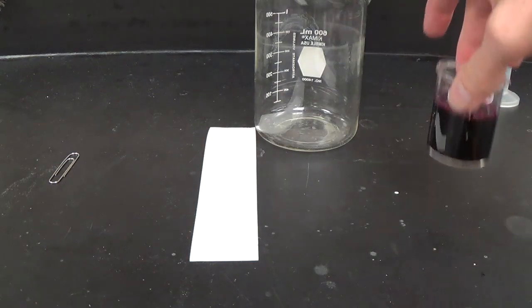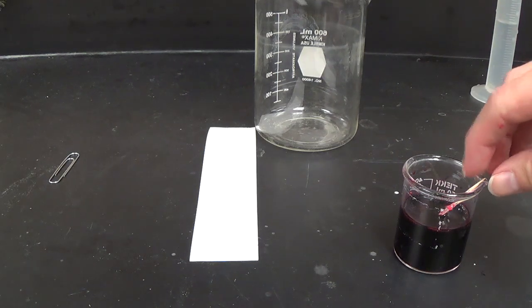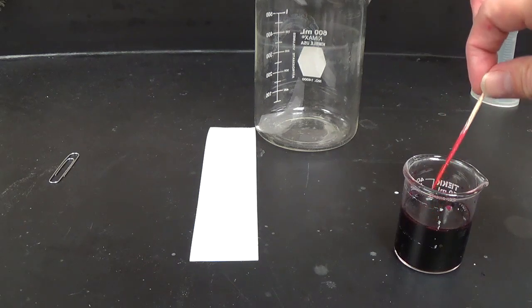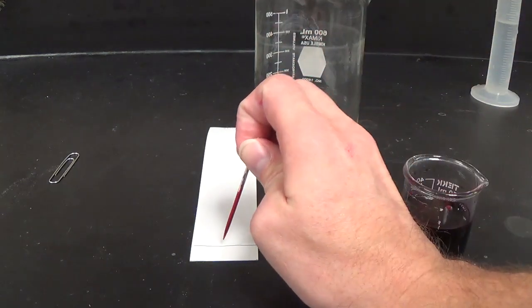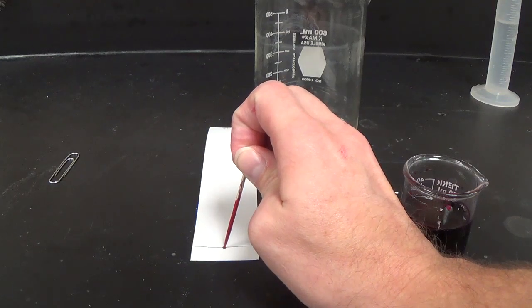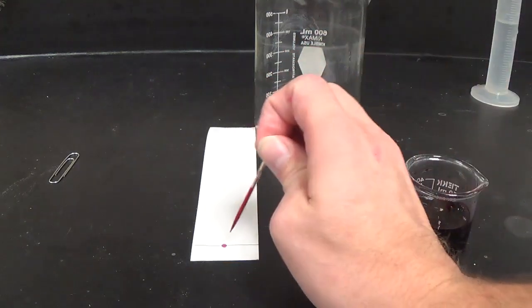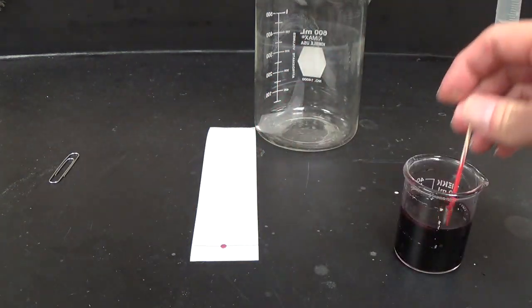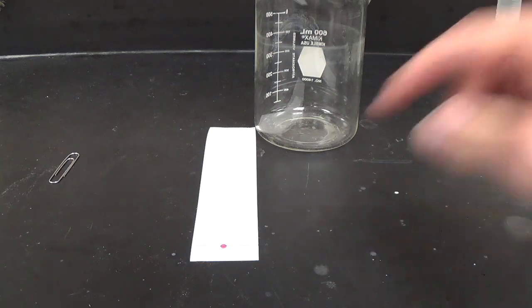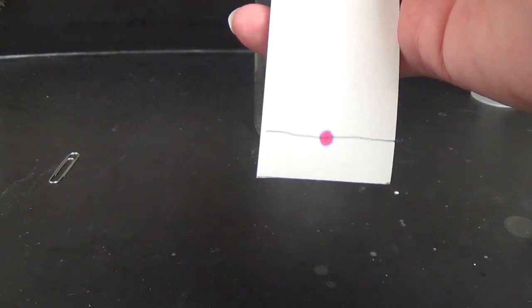So I have purple stuff. And you, of course, you will know in class what we're using. It's going to be a common everyday thing. But I'm going to take the toothpick that's soaking in my purple stuff, and I'm going to use the tip of the toothpick by holding it on the starting line to put a dot. And I'm going to re-dip, and I'm going to tap it once again. So notice I'm not tapping for long, but I wanted to try and get that two-layer going on. So I got a good amount of purple stuff. You can see the purple stuff on my starting mark there.